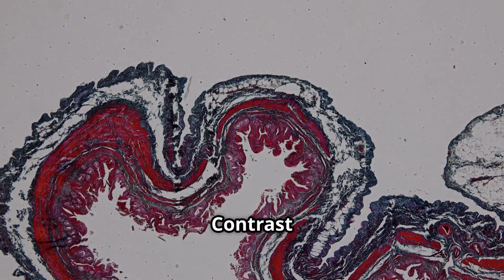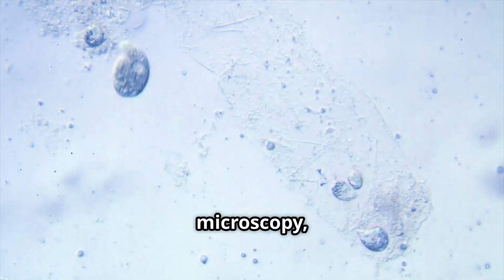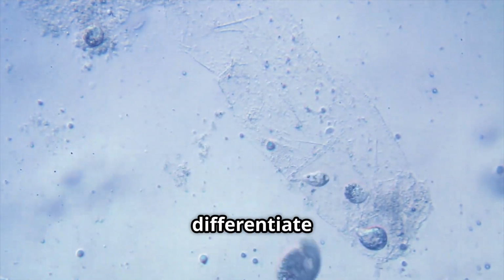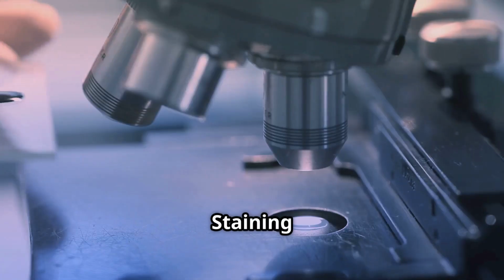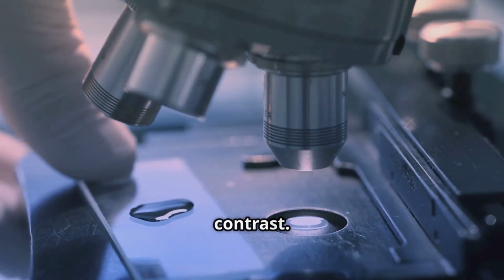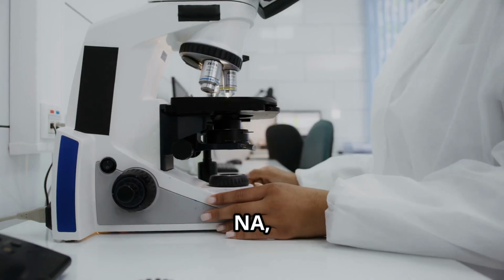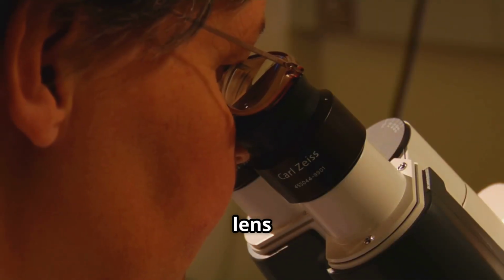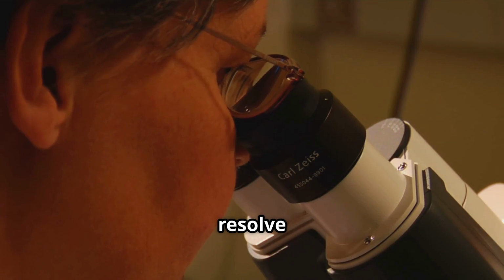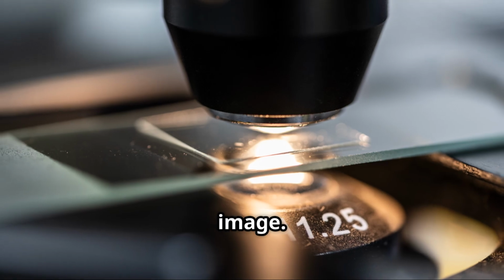Contrast: contrast is the difference in light intensity between an object and its background. In microscopy, improving contrast helps differentiate between various components of a specimen, such as cell structures. Staining and using special techniques can improve contrast. Numerical aperture, or NA, is an important concept in microscopy. The numerical aperture of a lens measures its ability to gather light and resolve fine specimen detail at a fixed object distance. A higher numerical aperture allows for a clearer and brighter image.